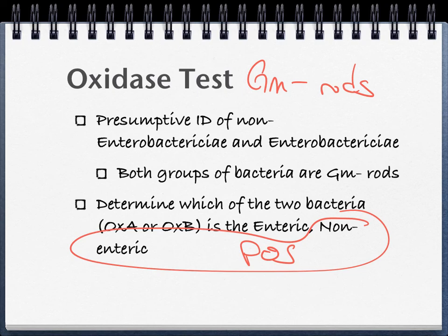In your book, so pay attention to this, please, because everyone always asks me for the reagent. In your book, there's like this reagent that you add to something, and then you mix with something, and then what does a positive look like? Anyone remember? Green? Nope. But we are looking for color. Purple. Looking for a purple color.